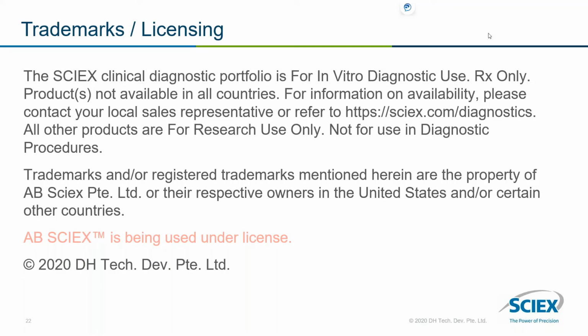Maybe just a comment from my end. We did an IDMP assessment for analytical or chemical analytical data on other projects, and our takeaway was that the IDMP required fields are a lot more high level than the things we are talking about here. So the granularity is one or two orders of magnitude higher than what's required for IDMP solutions.